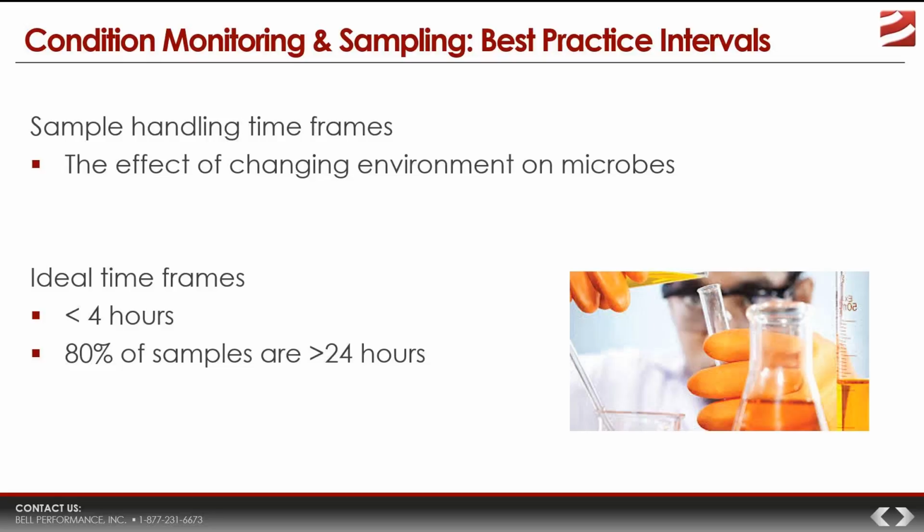So, what's the ideal time frame? Well, we can talk about ideal time frames, and then we can talk about ones that are feasible in the real world. The ideal time frame, if you could have your way, is 4 hours. The ideal situation would be you pull the sample and you can test it within 4 hours of it being pulled. That will give you the greatest chance of having results that actually match what is true in that tank.